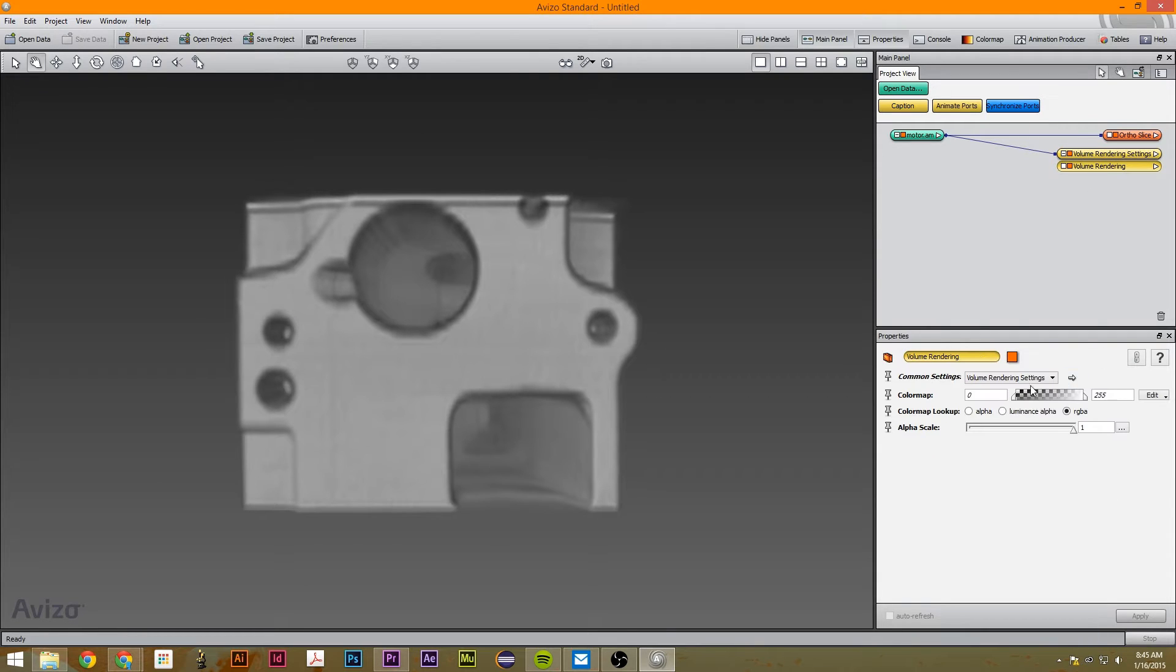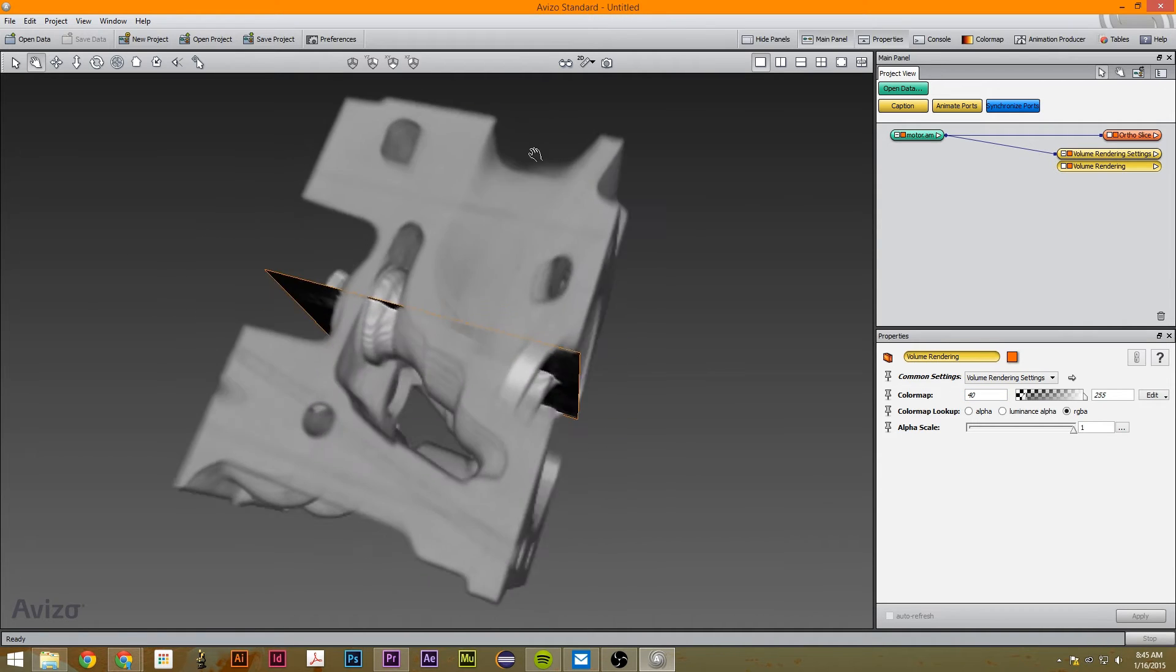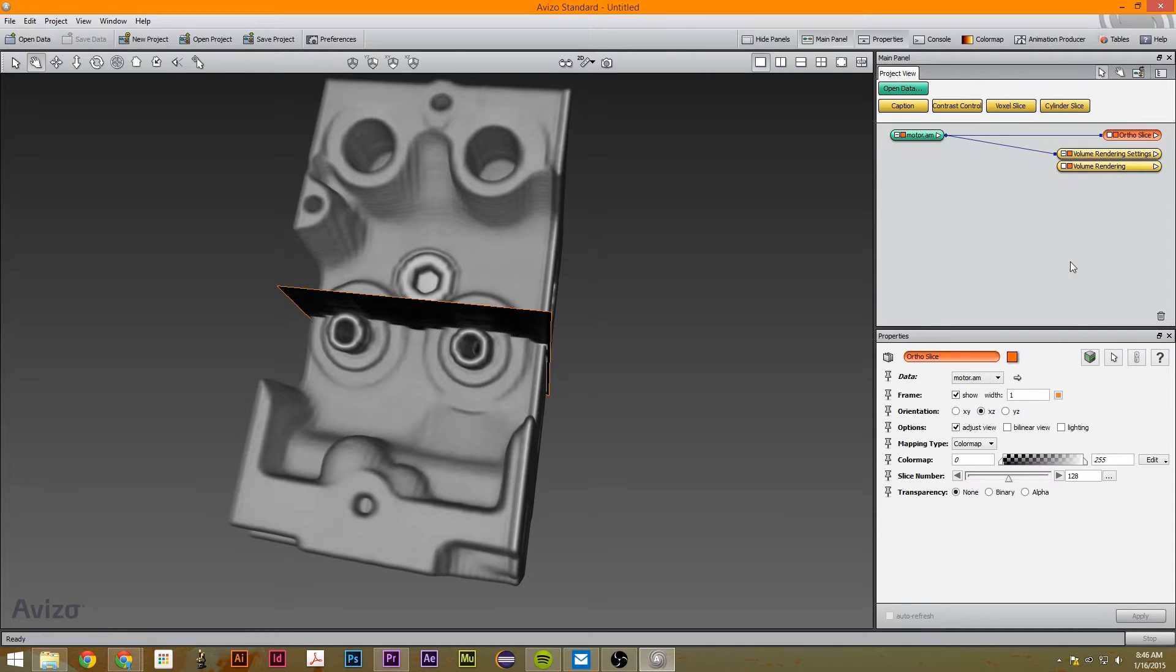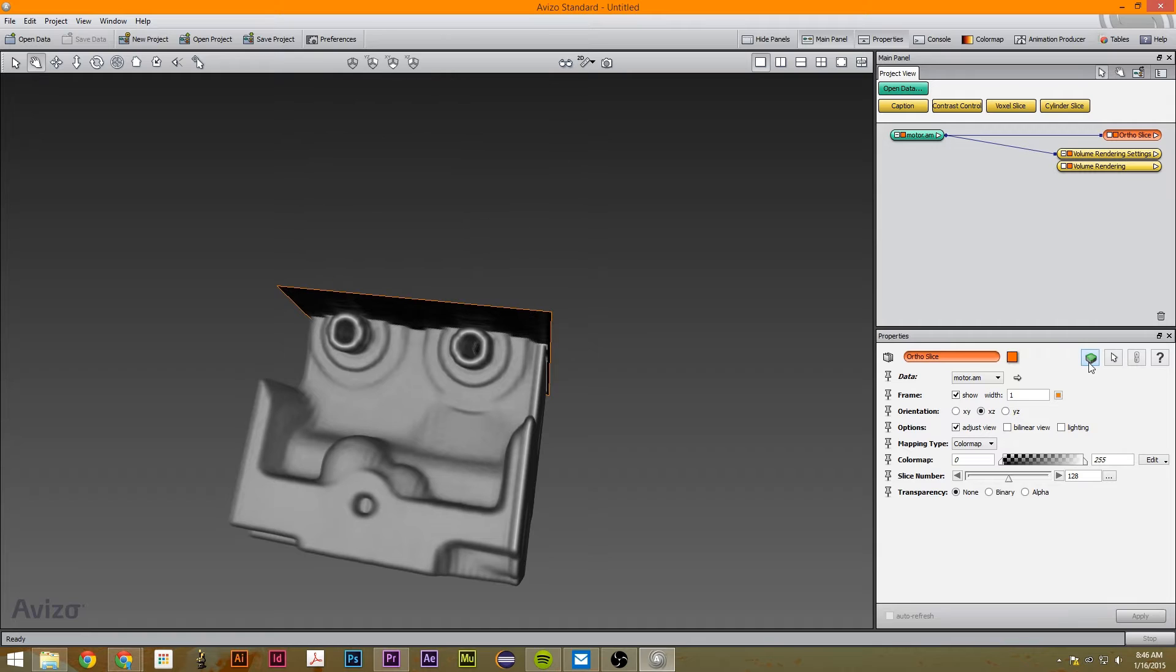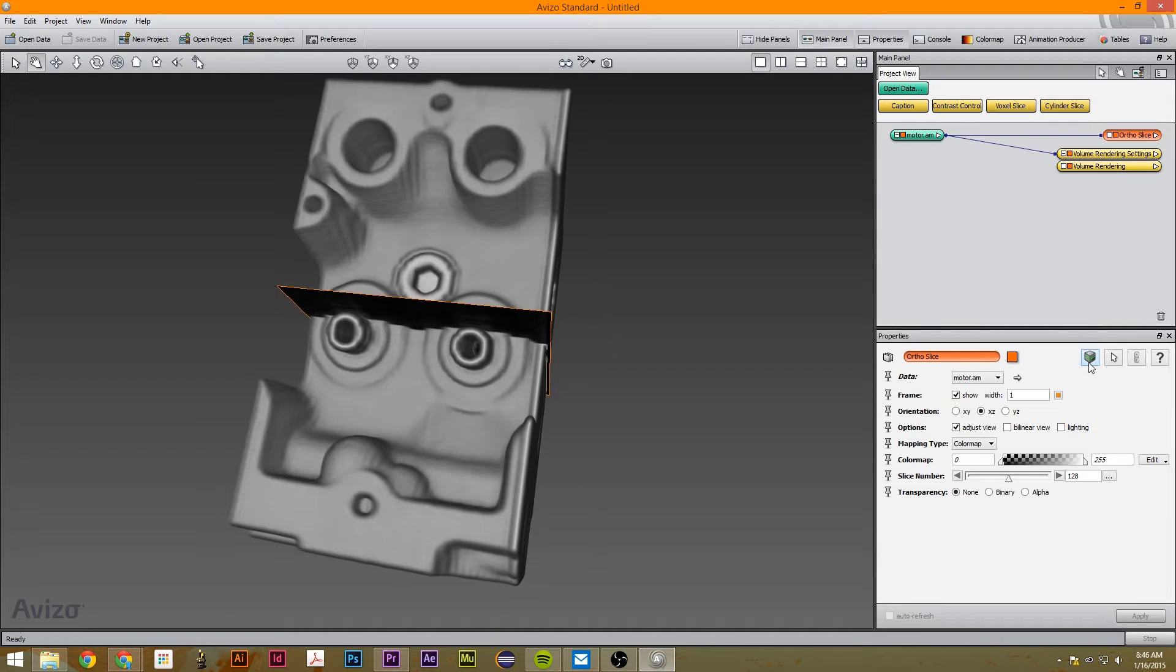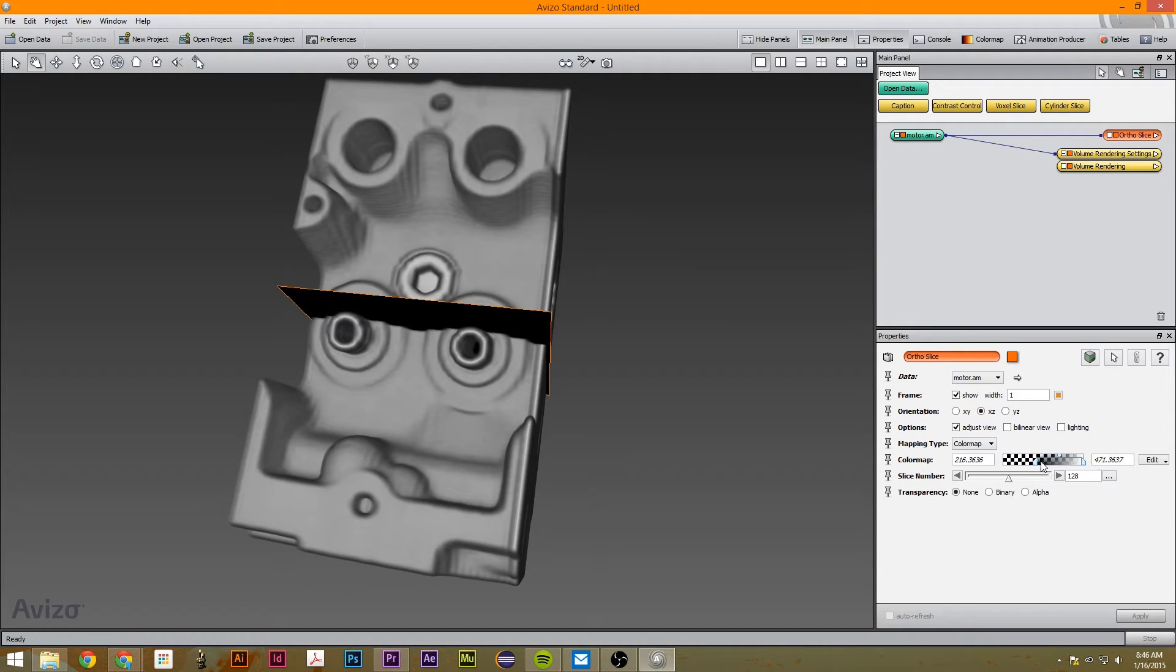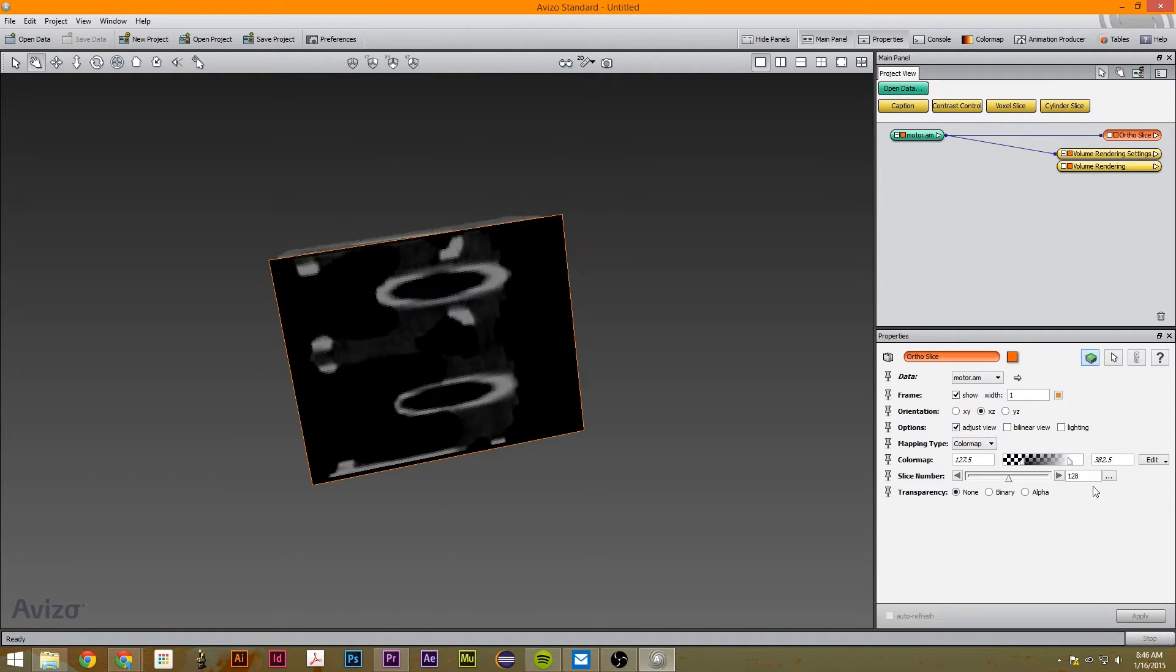I'm just going to set this volume rendering to about 40 just to get away from that fuzz. So with each orthoslice, there's one setting that's really important. You can use it to cut off part of it and then just like other stuff, you can use this to adjust it. I like keeping it cut so I can see the insides well.